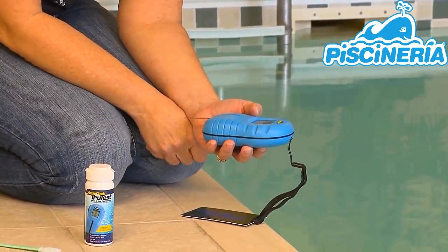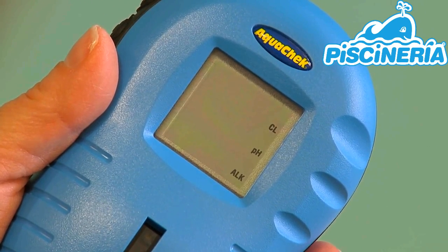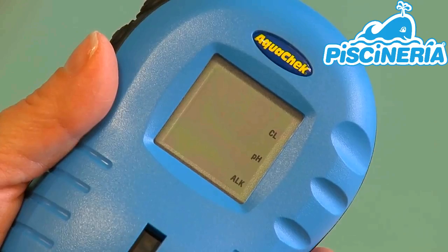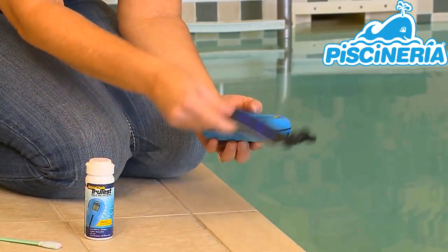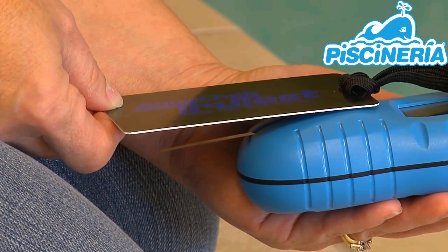You then will wait for your results, typically less than 30 seconds. During testing, the reader flashes the word ON, indicating that a test is in progress. If using intense sunlight, position the light shield over the test strip window to prevent interference from stray sunlight.